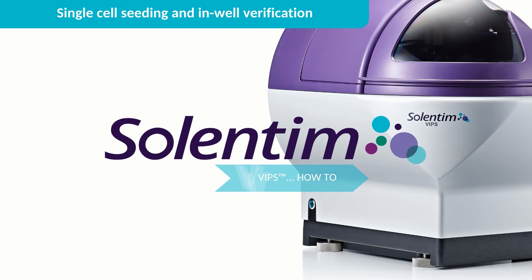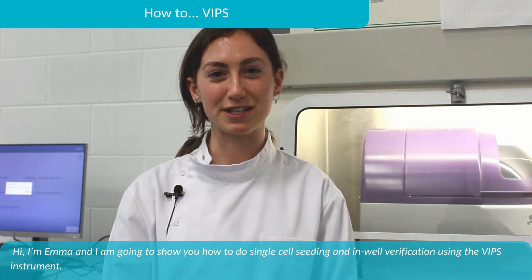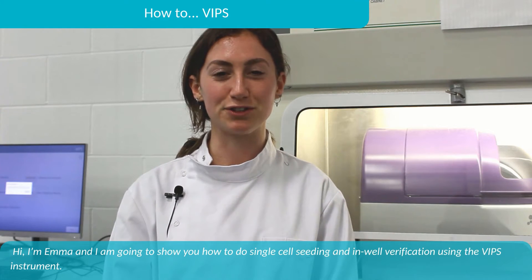Welcome to the VIPS how-to series. This video will show you how to use VIPS. Hi, I'm Emma and I'm going to show you how to do single-cell seeding and in-well verification using the VIPS instrument.